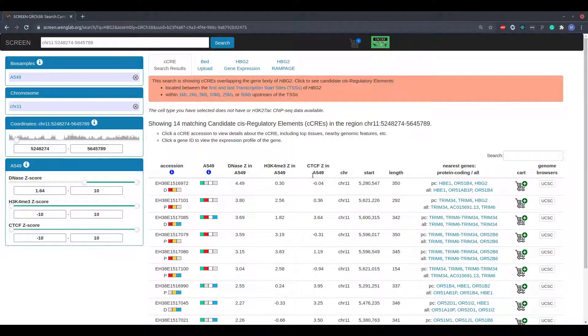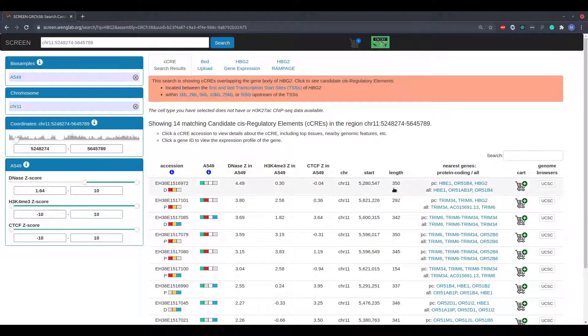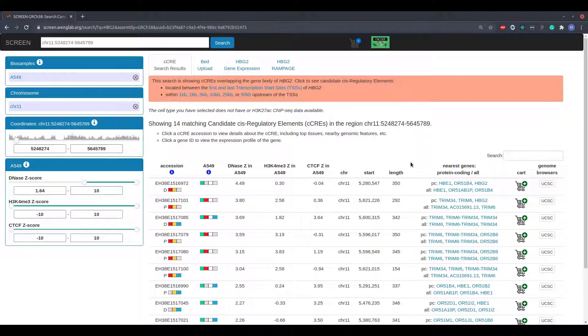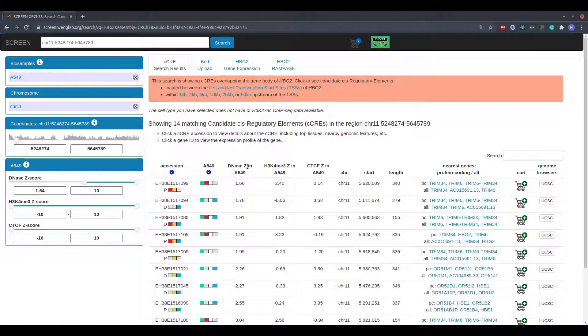The next three columns display the chromosome, start position, and length of each candidate regulatory element. The start position and length are given in base pairs. The Z-score columns and coordinate columns may all be sorted by clicking on their headers.